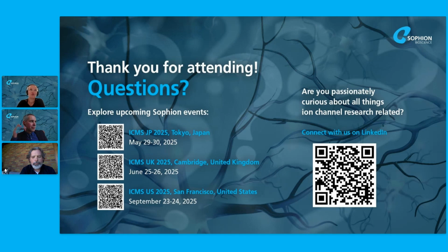When you work with iPSC neurons, the number of cells tends to be a bit scarce, and that hampers success rates. And then the purity of the cell suspension. So sometimes going through a more extensive purification, for example, using cell sorting, can also increase the success rates. But I think in the very best case with the neurons, that is around 70-75% that I have seen so far.